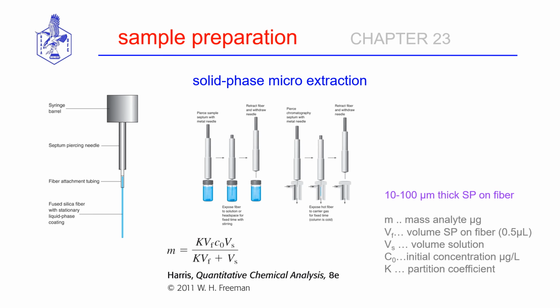If we are doing an analysis in which our analyte components are at the parts per million, parts per billion level, that is called a trace analysis. It is usually to our advantage to pre-concentrate those species at a higher concentration before introducing them into the gas chromatograph.